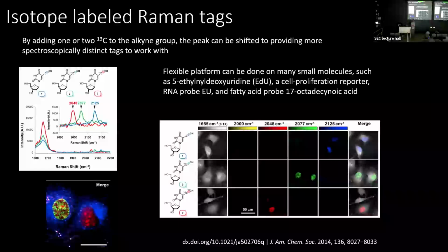Yeah, thank you very much for your talk. I'm just interested in knowing, can surface enhanced Raman spectroscopy measure small changes in biomarkers? Like you can measure small change within 2 months' time, you can increase the specificity of the test.